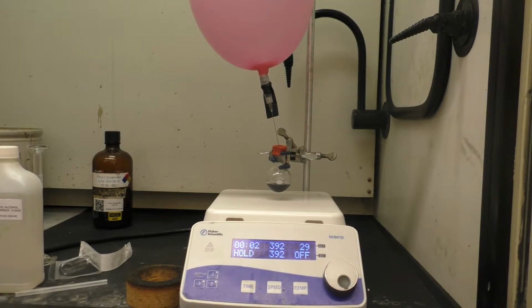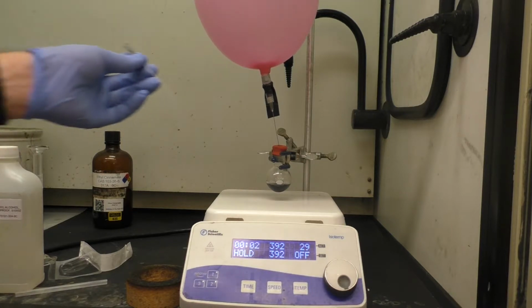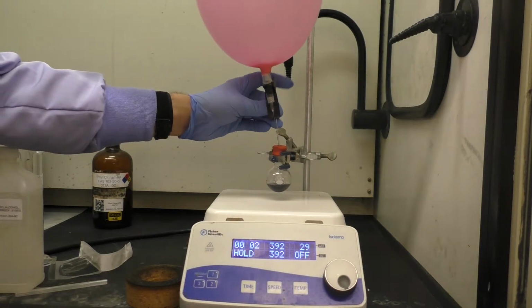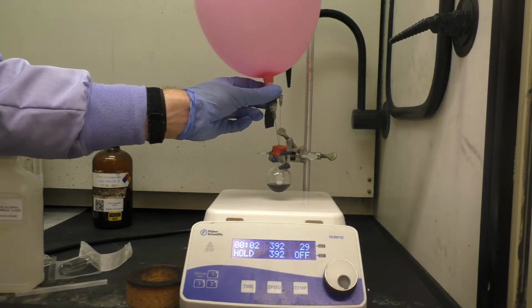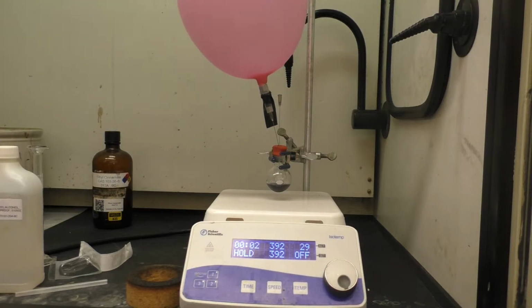One other thing we need to do to ensure that the atmosphere above the reaction is hydrogen is we should technically purge out the air that's currently above the reaction headspace. We don't necessarily have to do this, but it will certainly speed up the reaction. And so if I take another needle, put it down through the septum into the headspace, and push my hydrogen needle farther down closer to the reaction, and then just let it sit here for a little while, purging out the air, filling that headspace with hydrogen. And then in about a minute or so, I'll remove that needle, and then we'll just let the reaction stir.